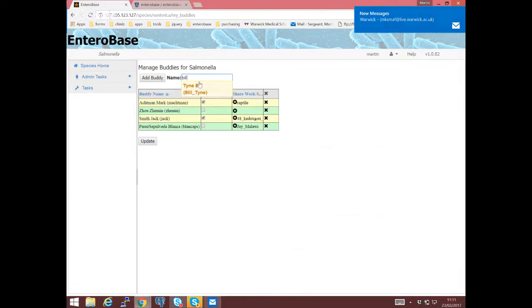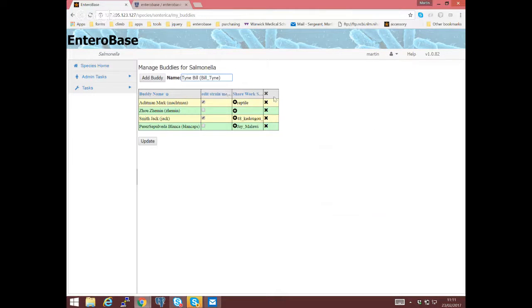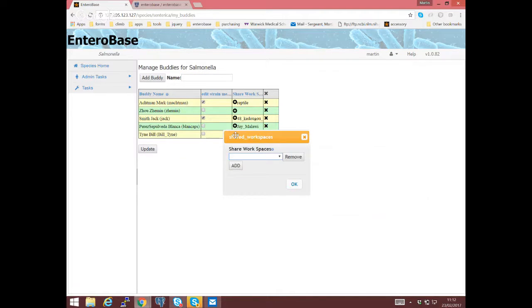Yeah, that's my colleague Bill. I'm going to share this workspace with him. So I need to add him, and then on shared workspace, I can click on this and share the one I've just created, St. Paul test. Okay, and then I can update it, and he'll be able to view that now.